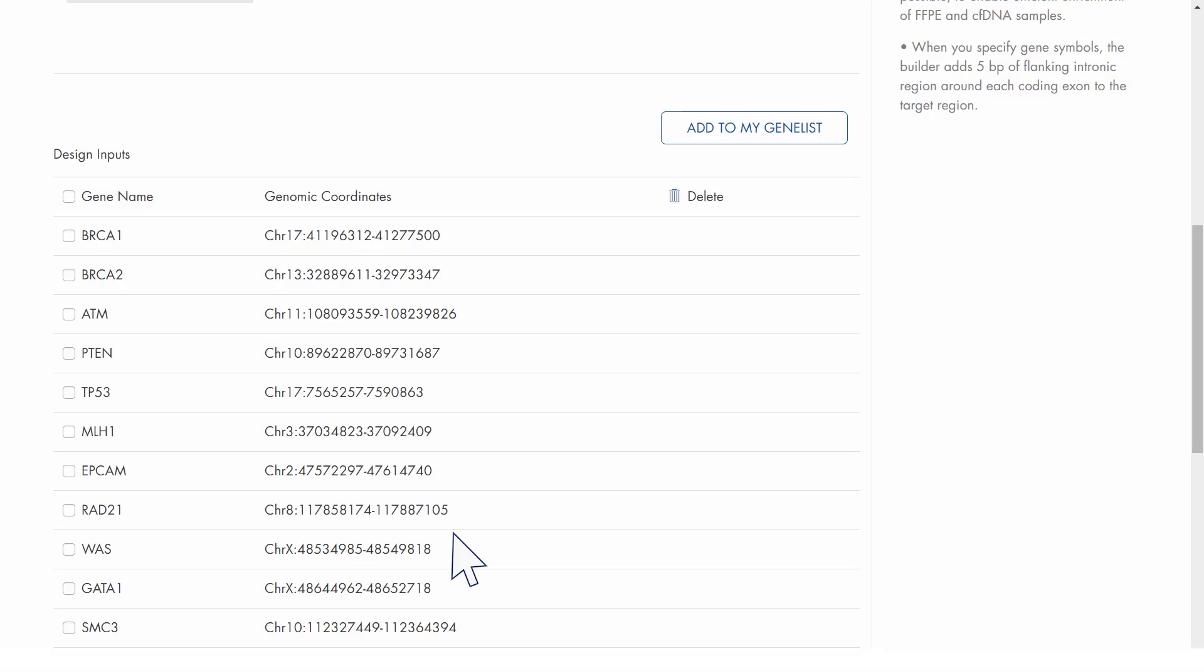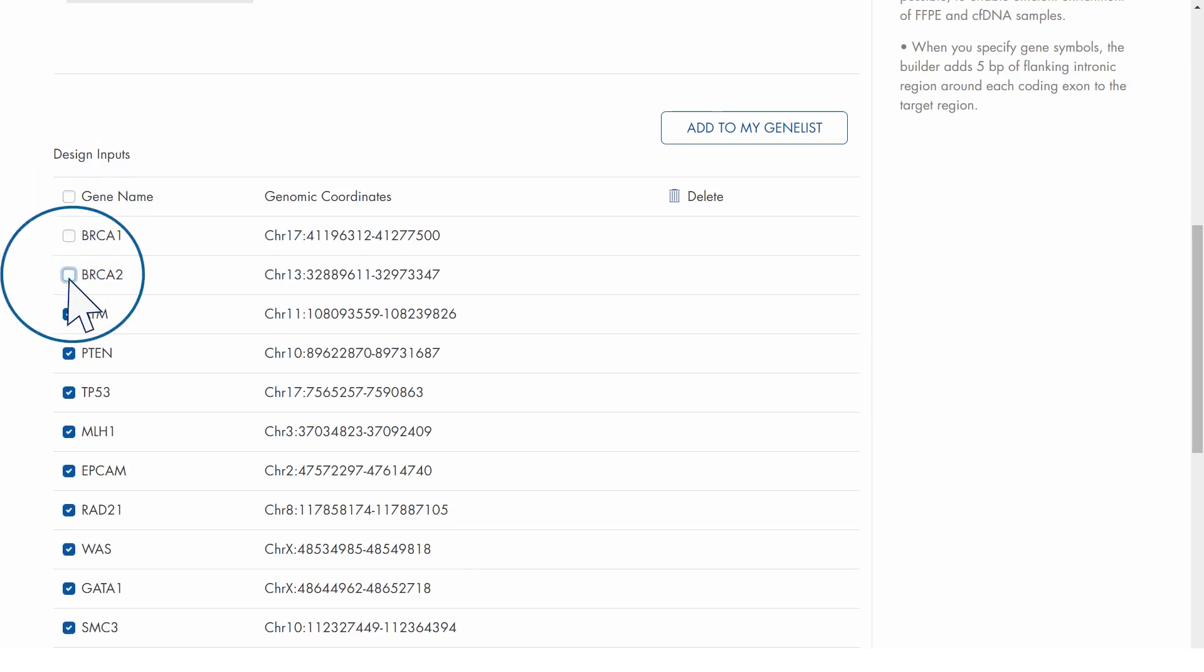To delete targets from your design, check the box next to the target and click Delete.